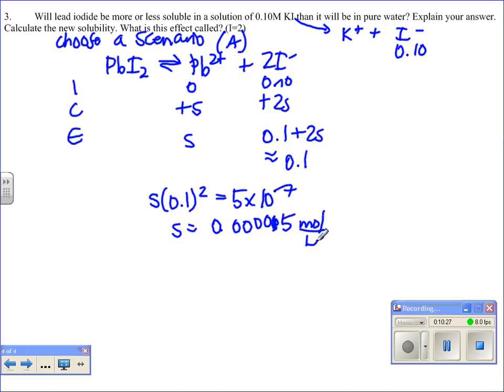The last thing that you need to do is to discuss 2 what-ifs for the reaction. And make sure that you're focusing on how the error will affect the calculated solubility or the value of the Ksp that you determine either for a particular temperature or for the room temperature range.